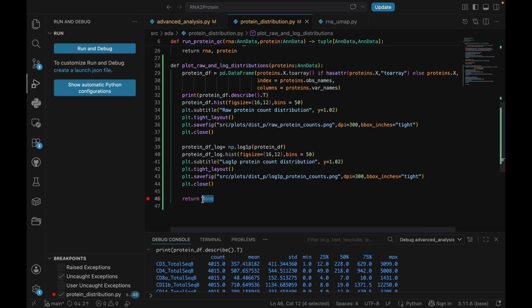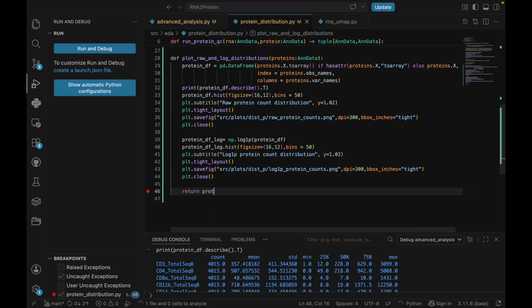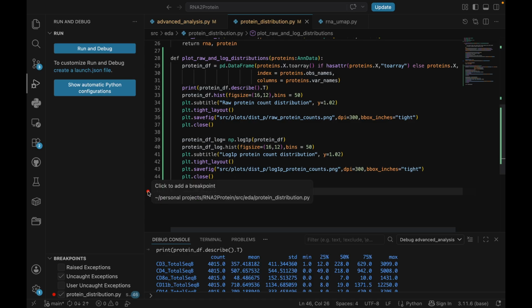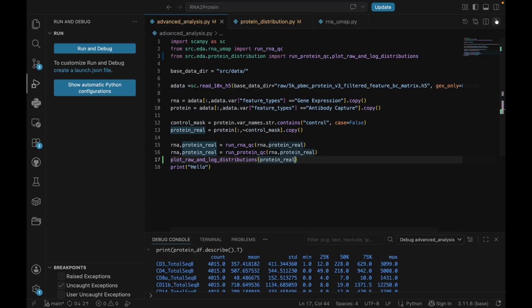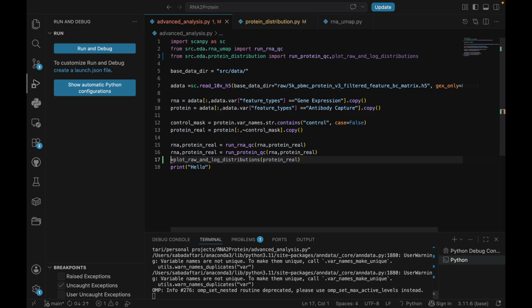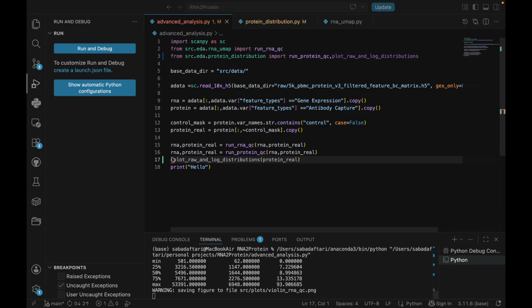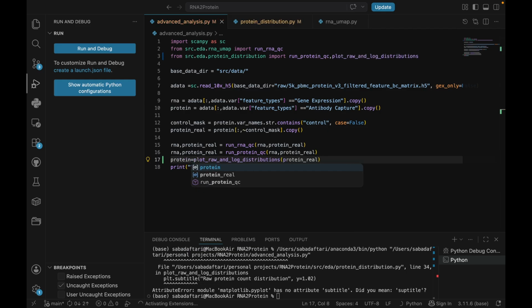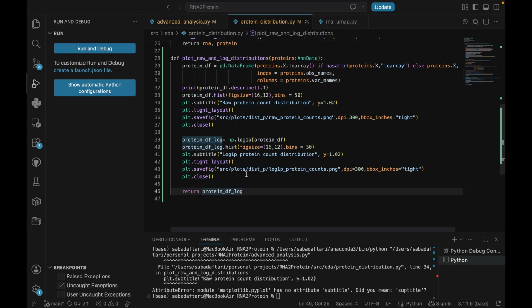So maybe we want to return the logged version. Okay. Now let's go ahead and try to run. Oh, this has not been assigned. Wait, okay, this is subtitle.